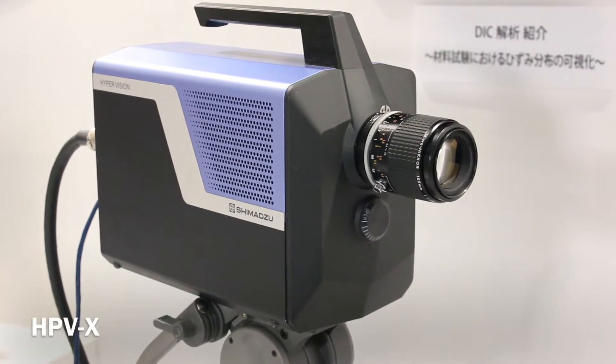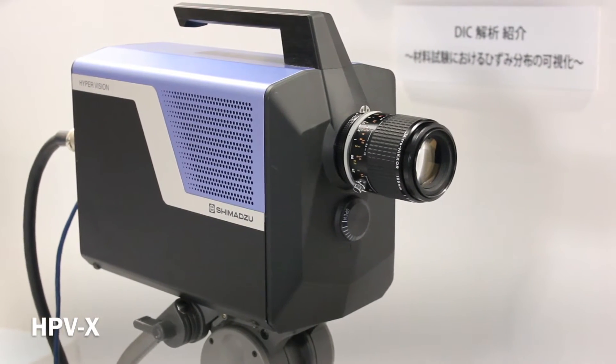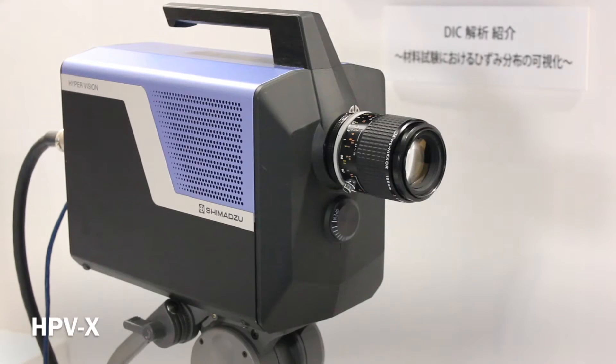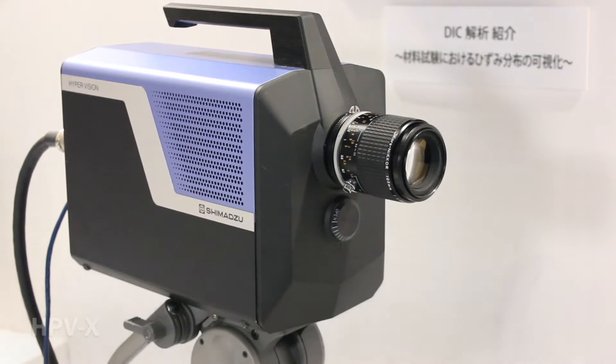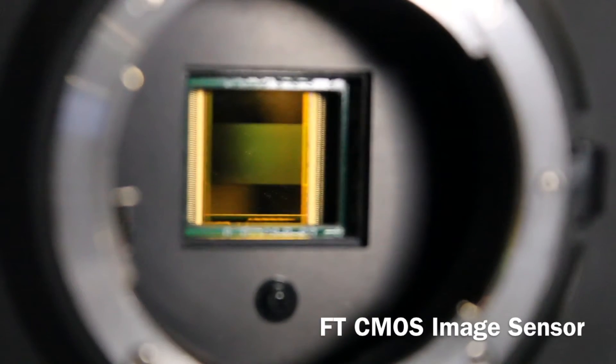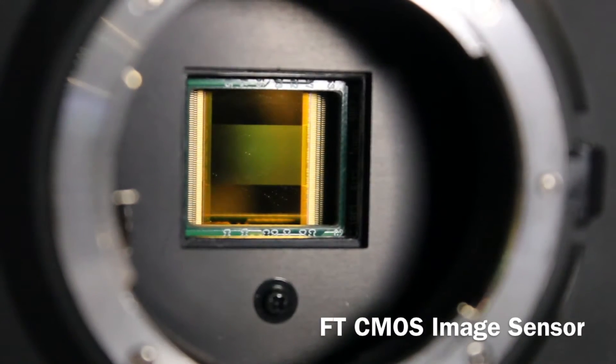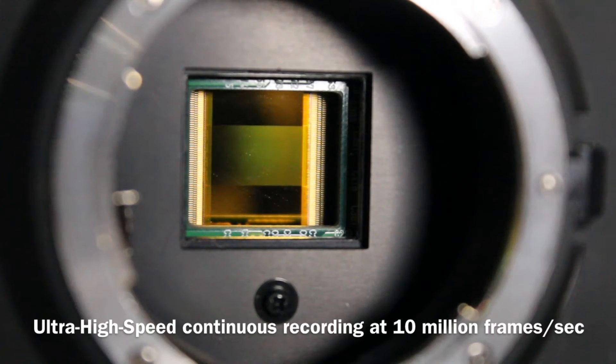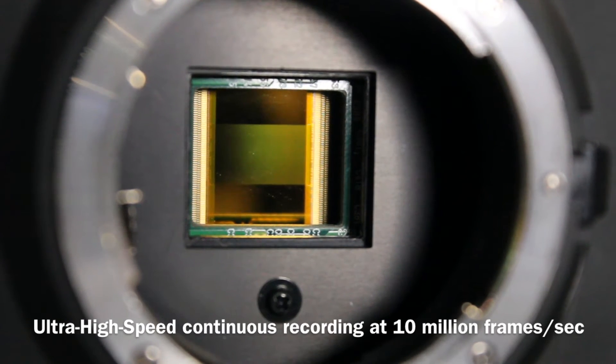HPVX high-speed video camera is equipped with a newly developed proprietary high-speed FDCMOS image sensor and achieved ultra-high-speed continuous recording at 10 million frames per second.